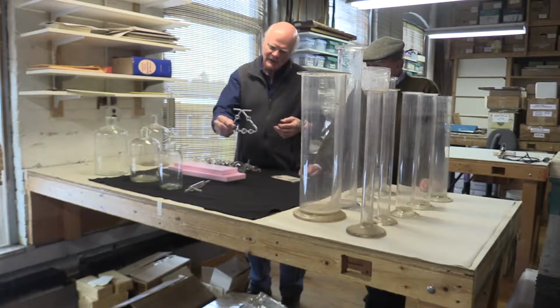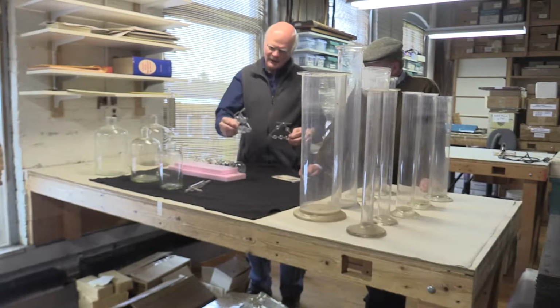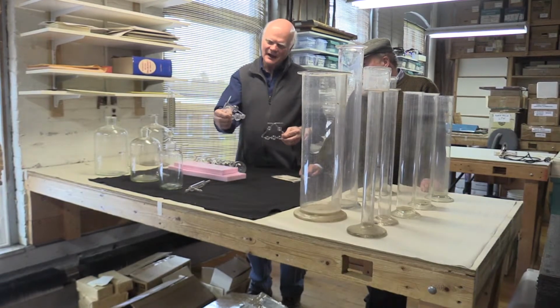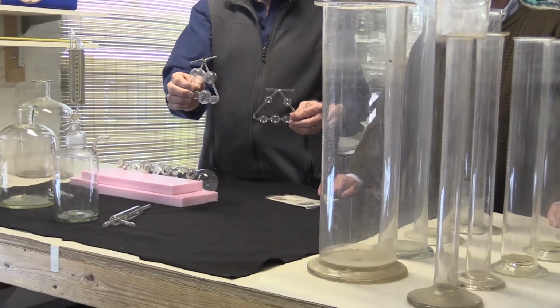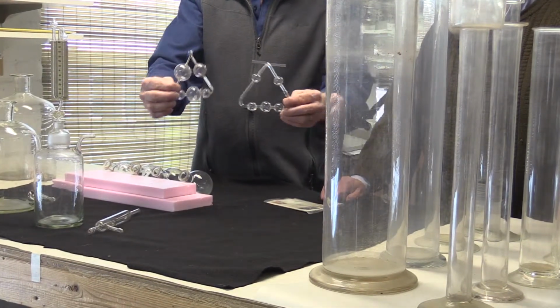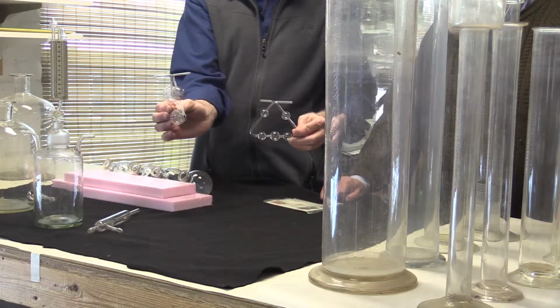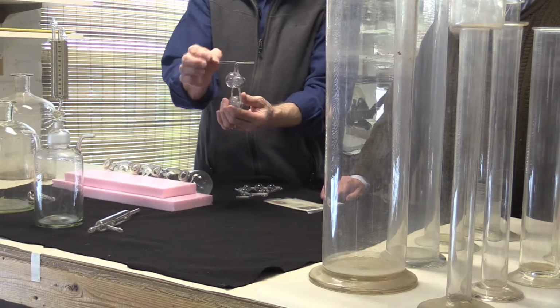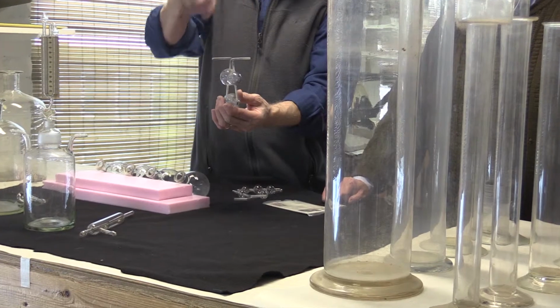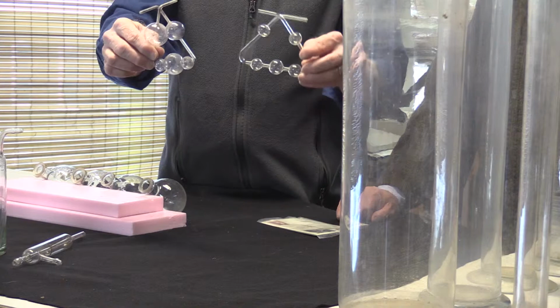Here's the reproduction of the potash bulb, or the Kali apparat, which I thought was really pretty cool until I found an original, one that had been used, from a German chemist who moved to Vermont. I'd love to see how somebody made this. It's just unbelievable. Now you look at the two, and in the images it looks flat, but it's not flat. It hangs this way, and this would actually hang from a stand, and then the gas apparatus would go off to either side. But it's so much more beautiful.